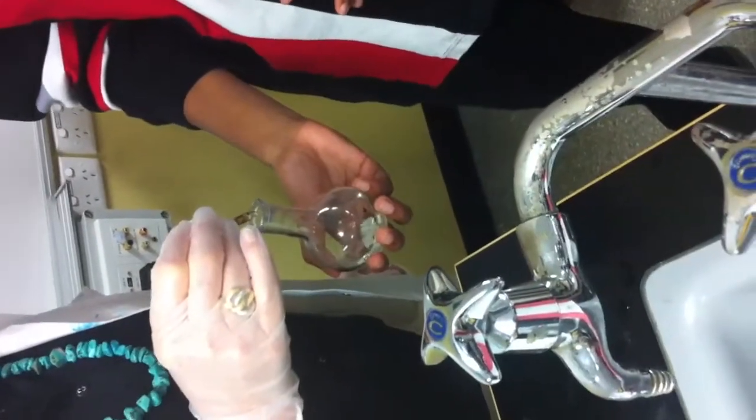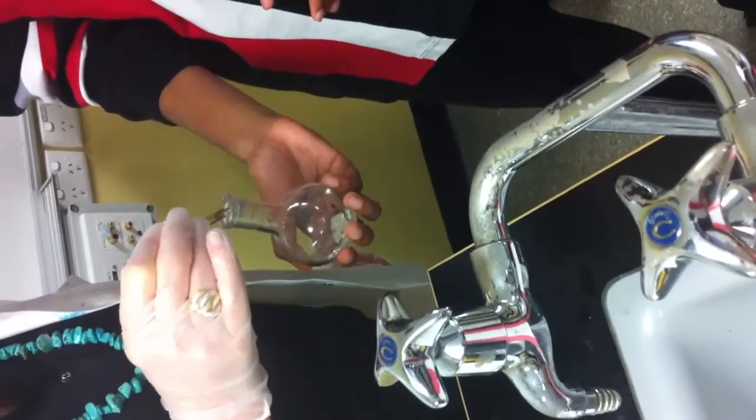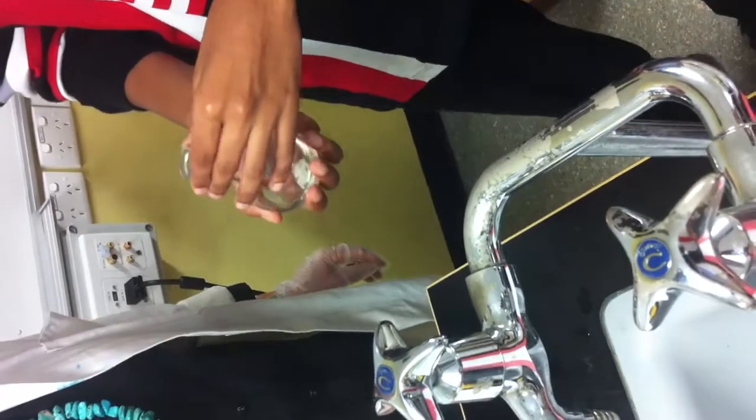So what are we adding? Sulfuric acid. It said 5 to 10, so I think 8 should be good. 8 drops of sulfuric acid. Excellent. Concentrated sulfuric acid dripping from the sides. So now we're going to connect it back.